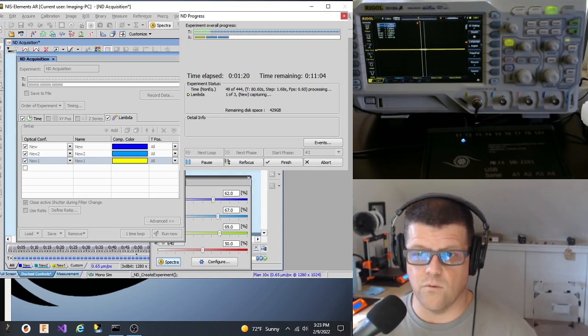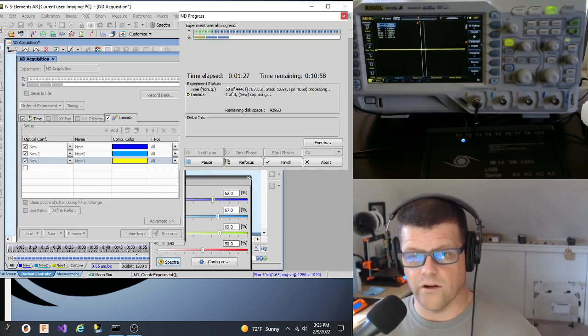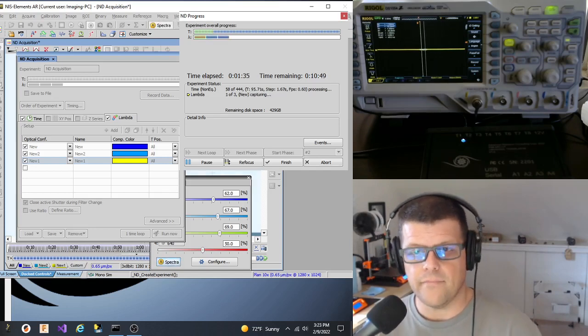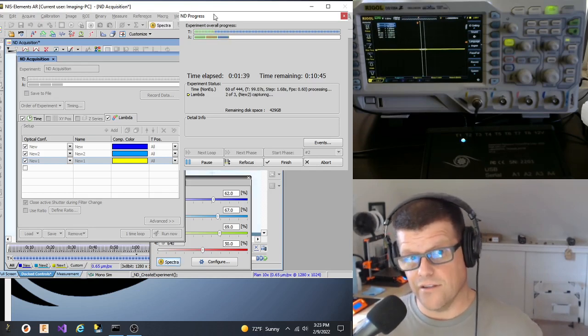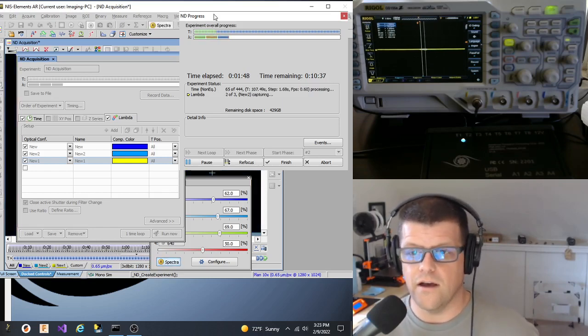So if there's things that you want to create that run off of TTL, you can use a commercial driver or a commercial compliant driver to talk to your software and then do whatever you want on the back end with TTL. Now, another thing to point out is that there's really nothing stopping anybody, including us, which we'll do depending on the situation, we can work with customers to do this.